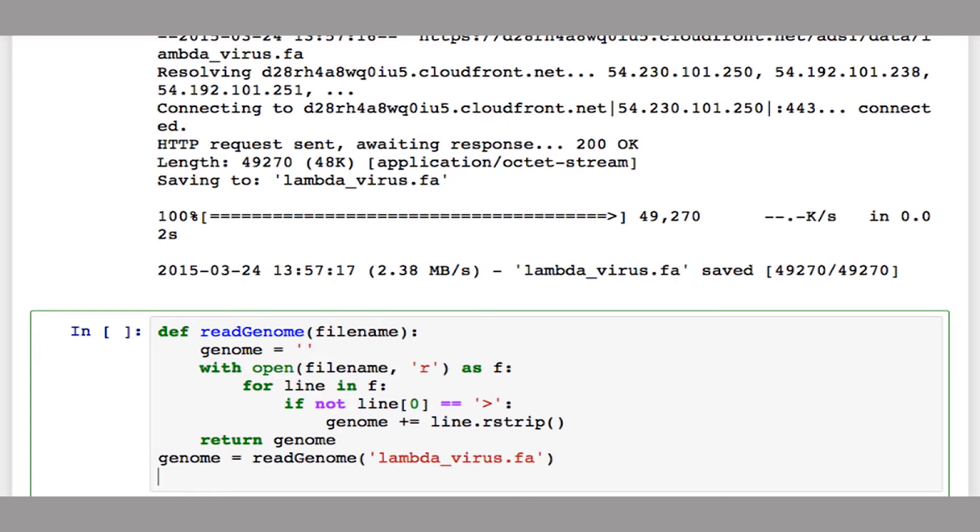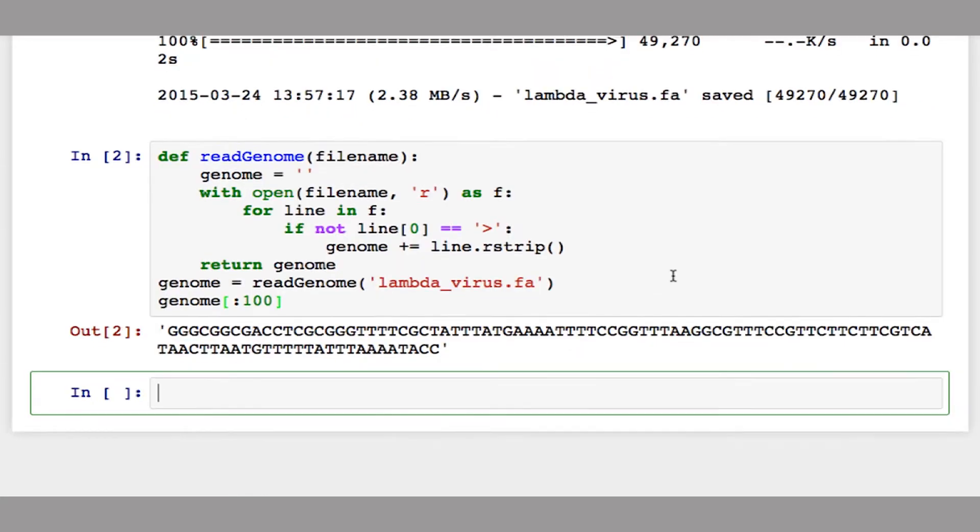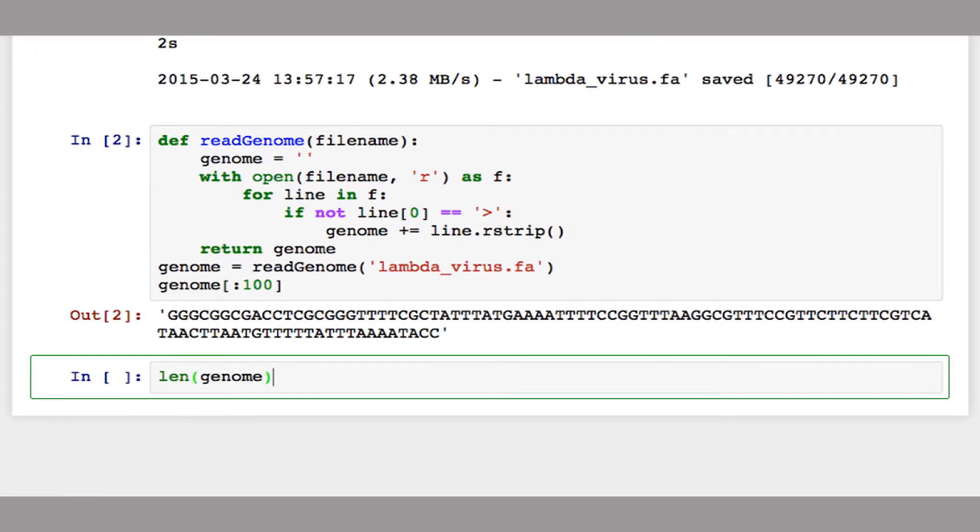And to make sure that we read it correctly, let's just print out the first 100 bases of the genome. So you should see an output like this. So let's also make sure that we read all of it. So let's look at the length of this genome. So the length of the lambda phage genome is about 48,500 bases long.